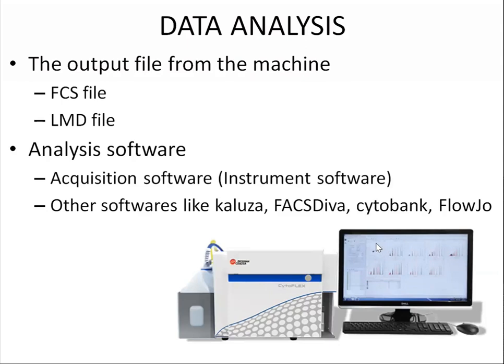Now the same acquisition software, post acquisition, you can use it for analysis. You can even use the same default software which comes with the instrument to do the analysis, and that particular software is called acquisition software, and you can also do analysis in that.